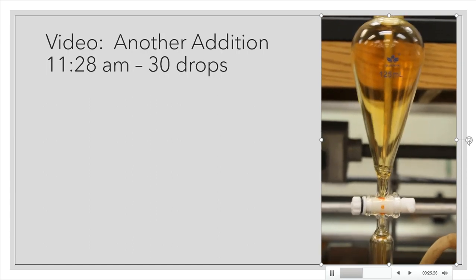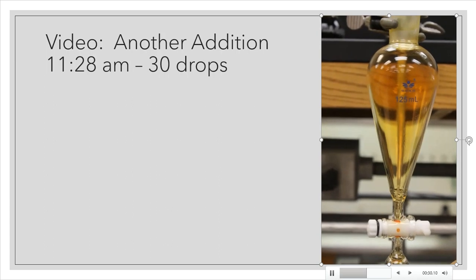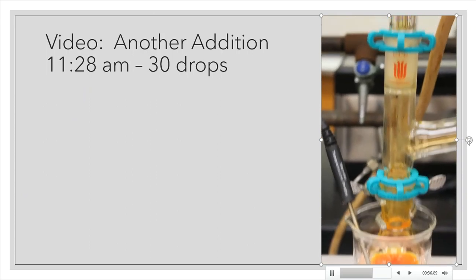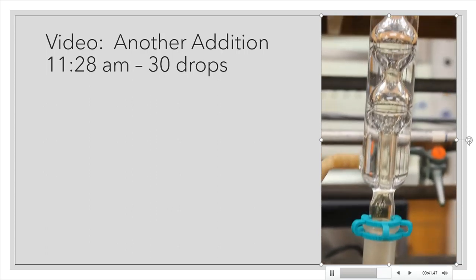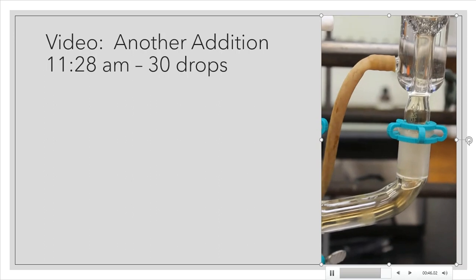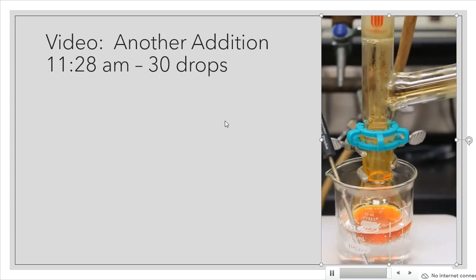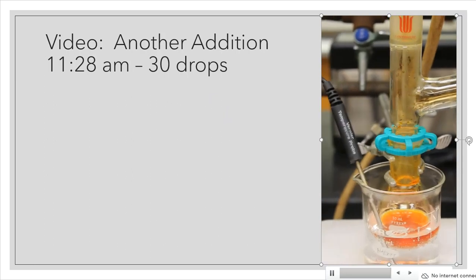Notice the orangey kind of haze that's left over in the separatory funnel, and all of that is due to the bromine that escaped the acetic acid while it was sitting in there. I'm seeing that that haze is also in the Claisen condenser, and as I go up to the reflux, the haze goes away. So again, a very good sign that my reflux is doing what it should be doing, keeping those vapors in the solution. So I'm going to wait for 15 minutes, come back, take a look at these observations, and see where we go from here.